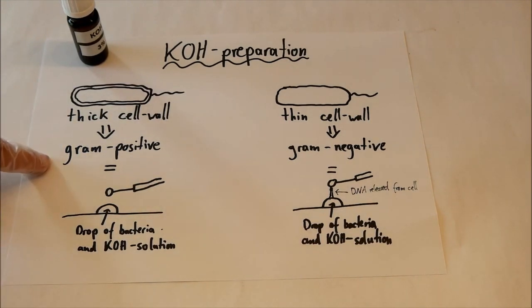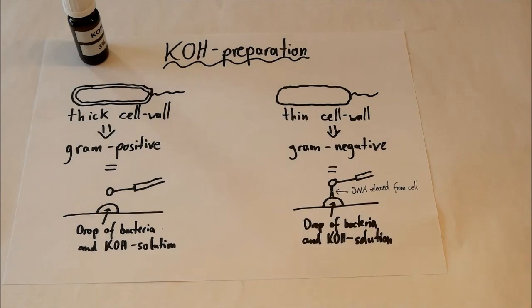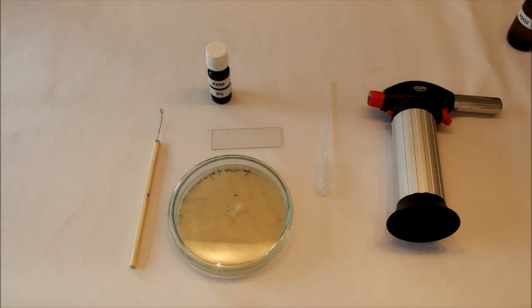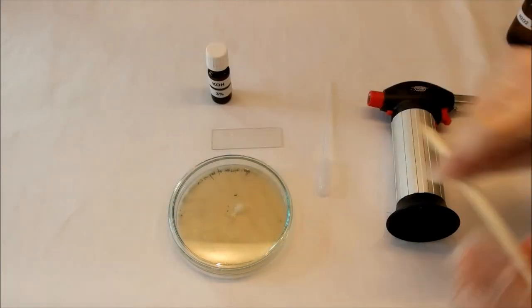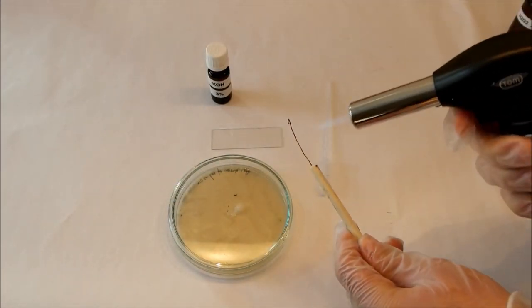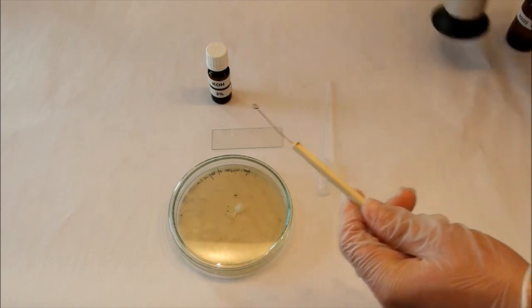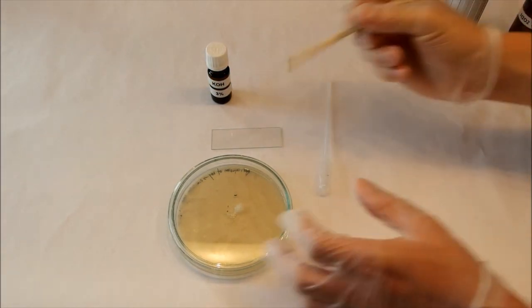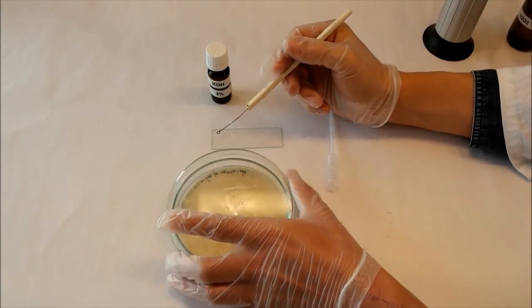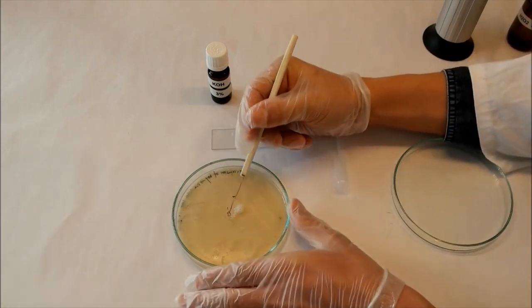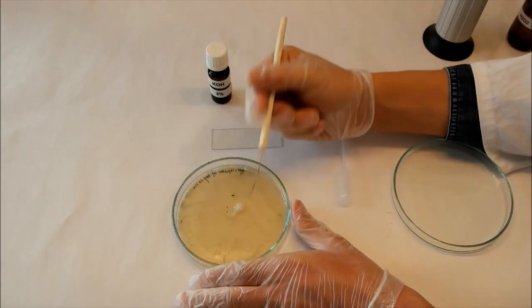So on gram negative bacteria, there will be thin lines of DNA between the loop and the drop. For this test, first you have to sterilize your inoculation loop, and then take a little amount of bacteria colony on your inoculation loop.